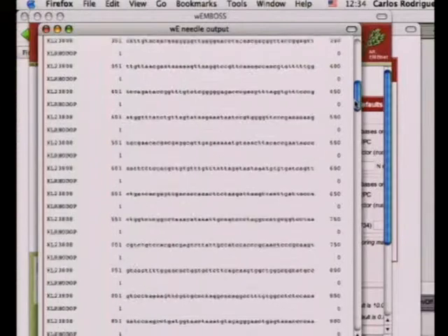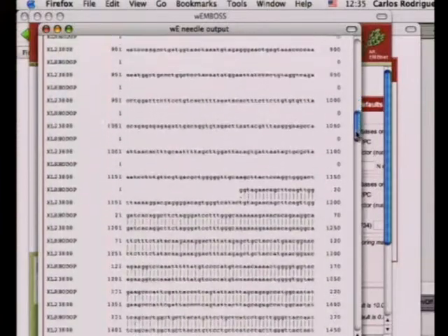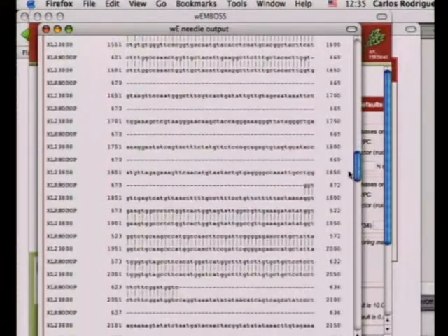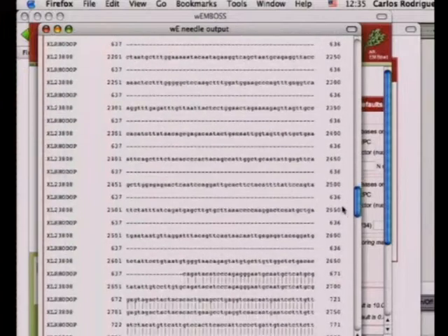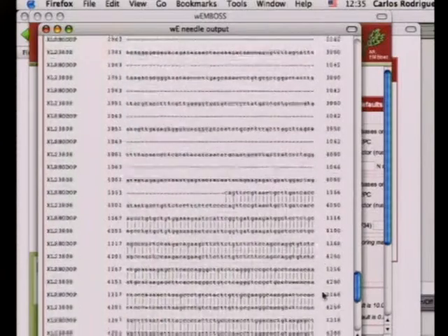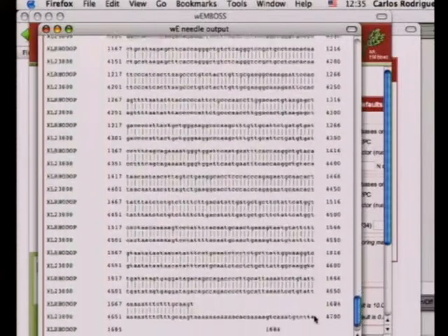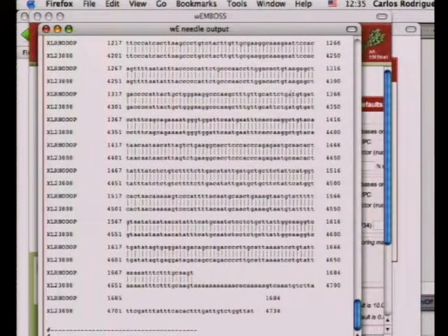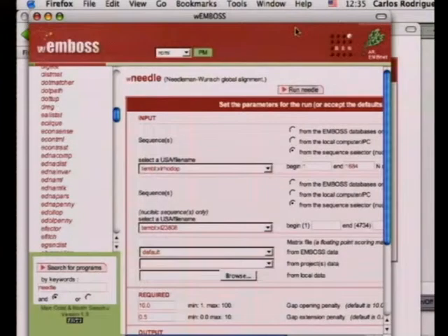And then a little further down, I'll start seeing stuff like this. A coding region. One, two, three, four, five. What a surprise. So we can again see that we've got a perfect alignment of the coding regions with the genomic DNA in these 5 exons. Right? So we're happy.